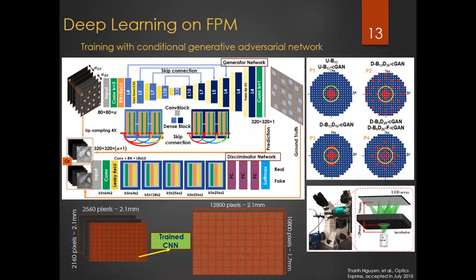One of the criteria in the microscopy field is that microscopy cannot go below 1 micron in resolution. But in our case, we definitely beat that. For one reconstruction, the traditional method takes 25 minutes, but we only use one tenth of the number of inputs to produce the image in 8 seconds.